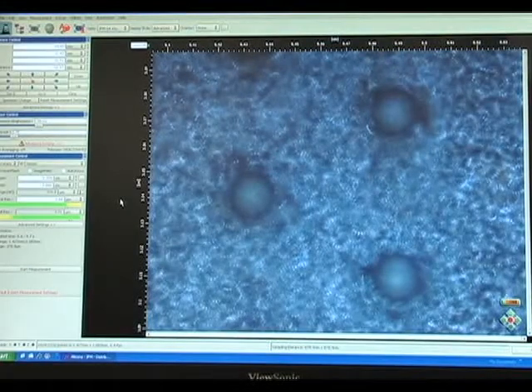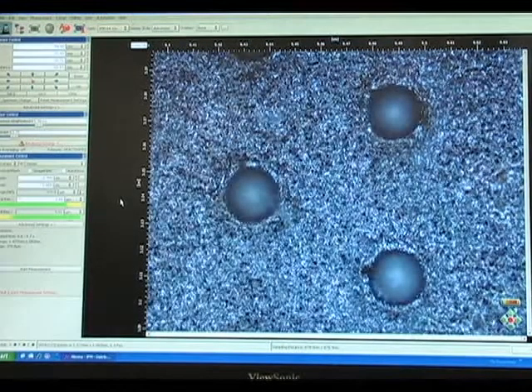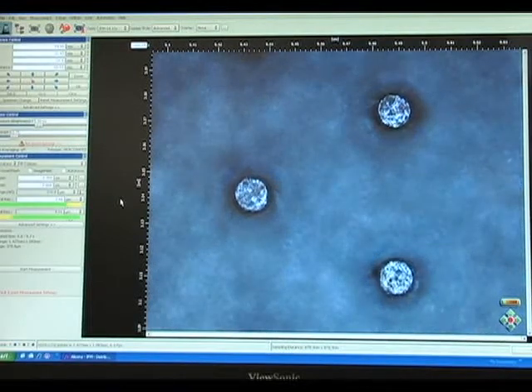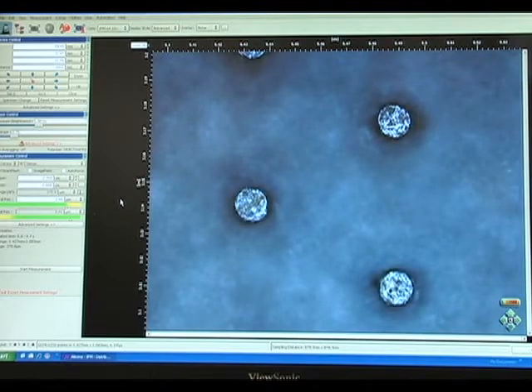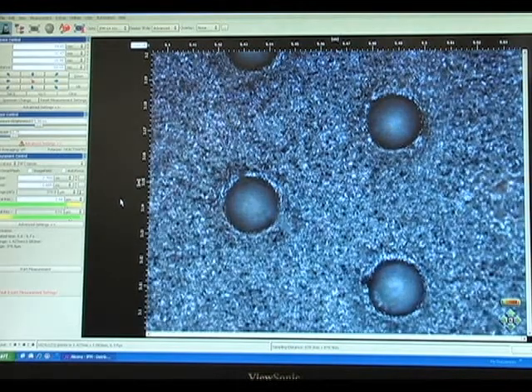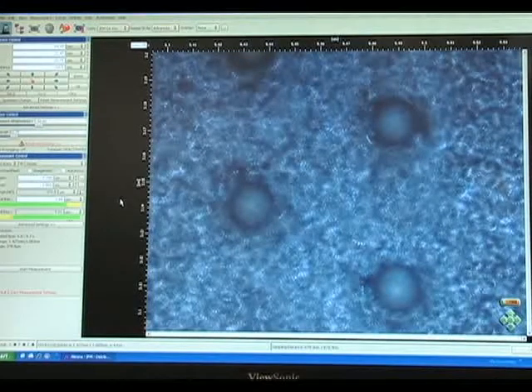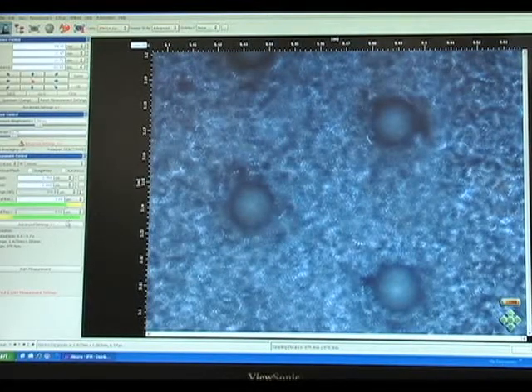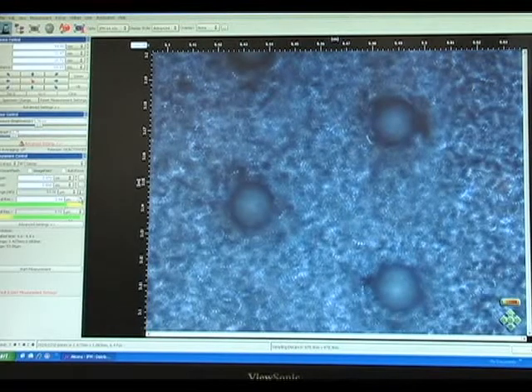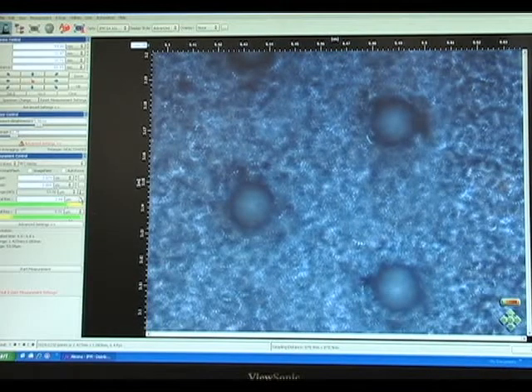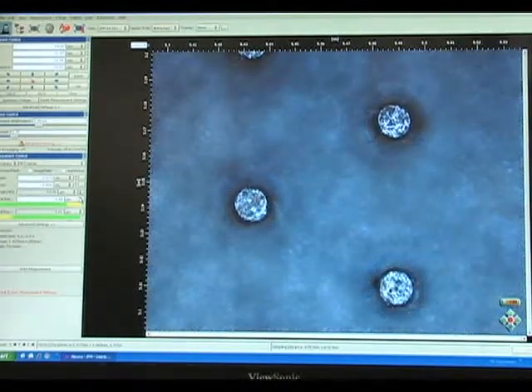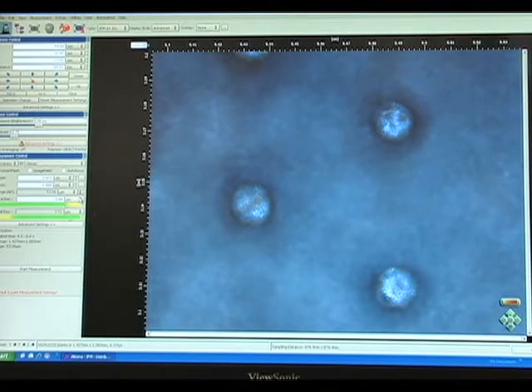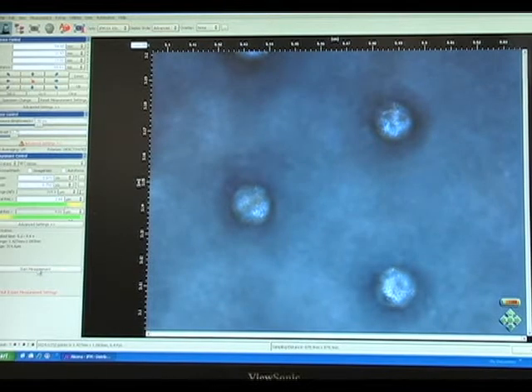In the live view, as we move the Z drive up and down, you can see from the screen that we are going through focus in the upper and lower position. We move to a low position which is slightly out of focus and select that position in the software. We then go in the other direction until we go completely through focus again and mark that position. We choose the lateral and vertical resolution and press start measurement.